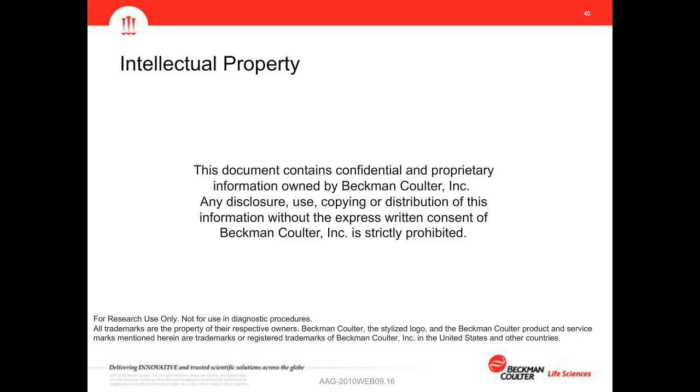It also could be something like normalization, where you're using concentration information to drive a volume that's being transferred into a destination plate. But the idea is that you would use that CSV file, attach it in the beginning, and then you don't have to deal with information, no copying and pasting until you're back in Excel at the end, and that Excel file is being produced as a DART report. That's kind of the gold standard. That's what we would encourage you to strive for, and I think that we've done a good job of removing any of the intermediate CSV files from this type of processing.